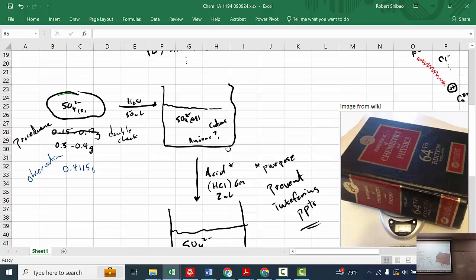Let's say you spilled some hydrochloric acid on a wet sponge. You might wash the surface off immediately, but the stuff that gets absorbed in there is more difficult to wash out. And so wash for 15 minutes. Let's say if you spill some on your arm, then you want to wash with soap and water. Usually that works good. And rinse. You might rinse for 15 minutes, but I've spilled lots of hydrochloric acid on my hands and arms. It wasn't so bad.